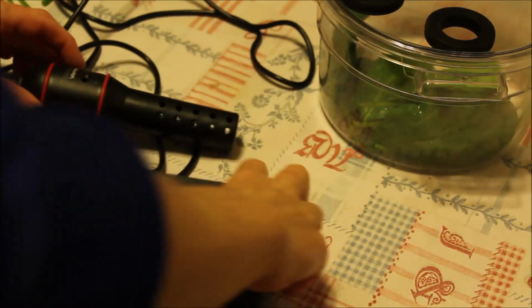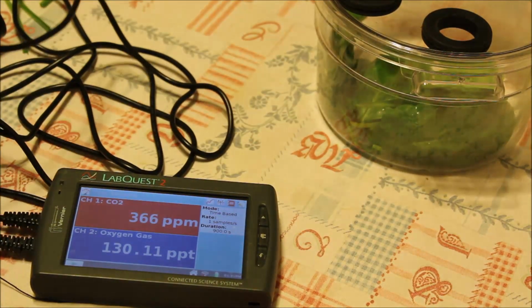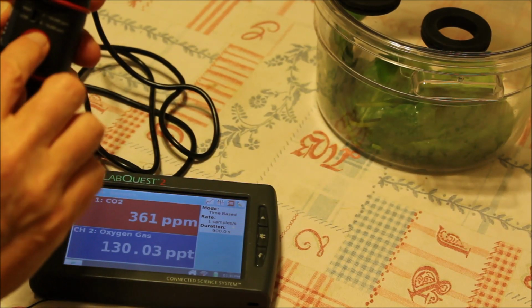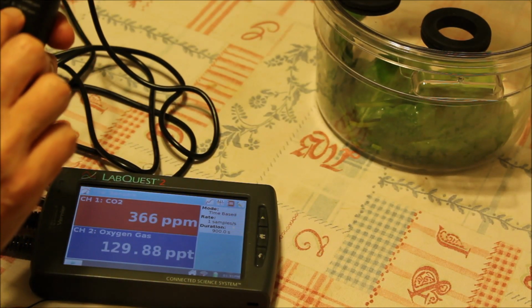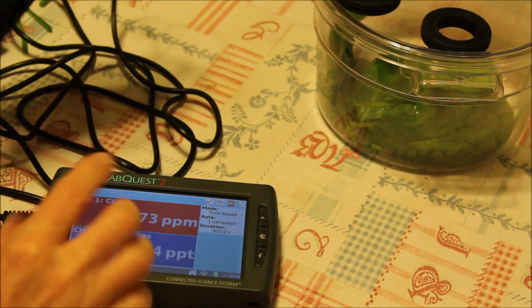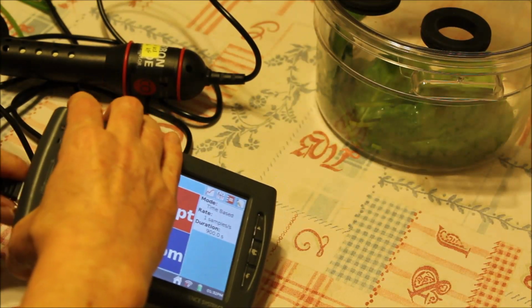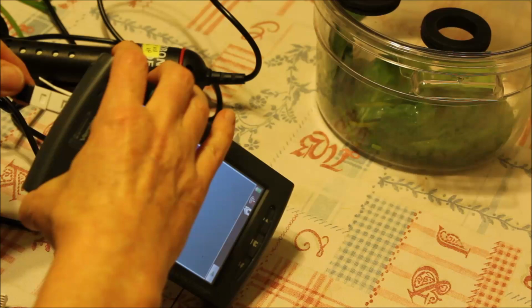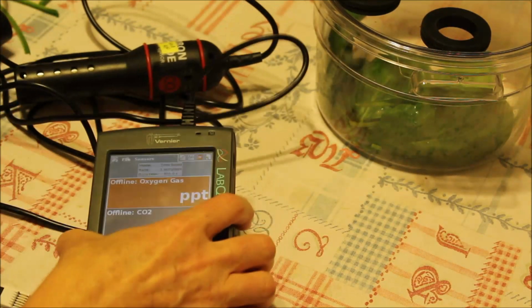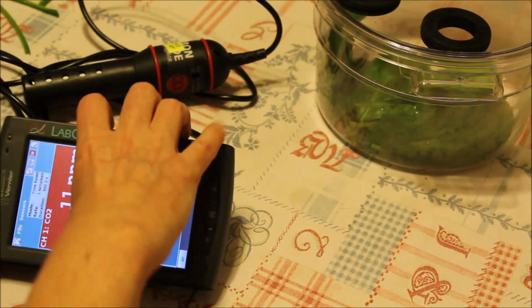So to set up your machine, you just turn the CO2 sensor to the low setting, so 0 to 10,000 parts per million measuring. You just hook this on the side. Another way. Good. And you will hook up the oxygen sensor too.